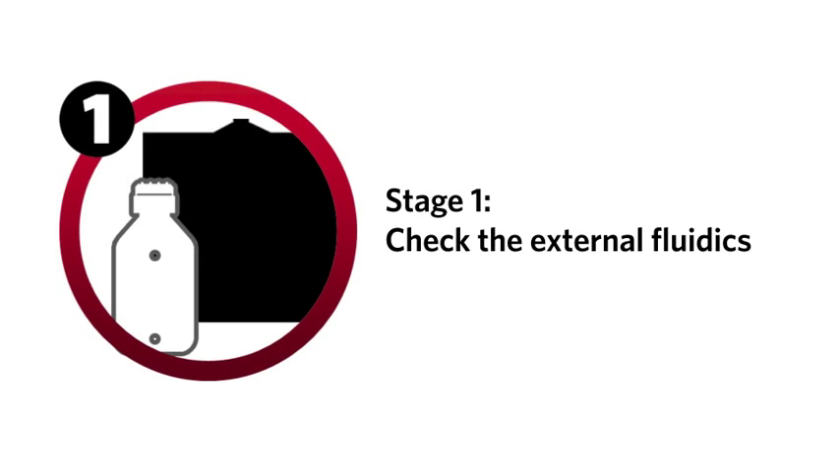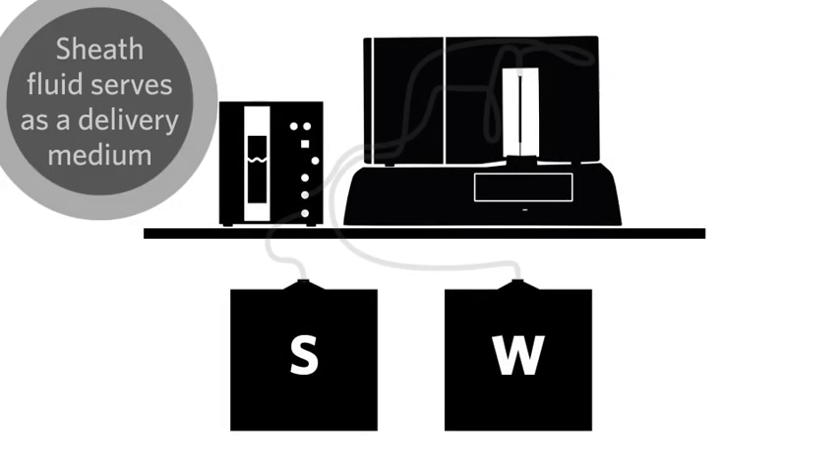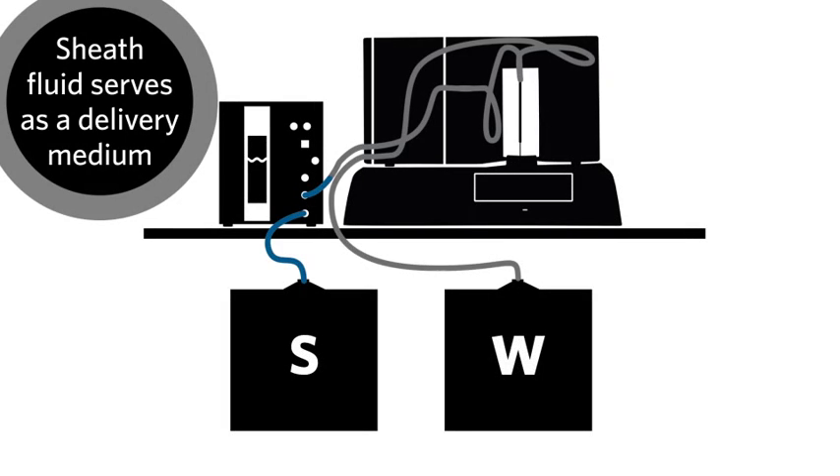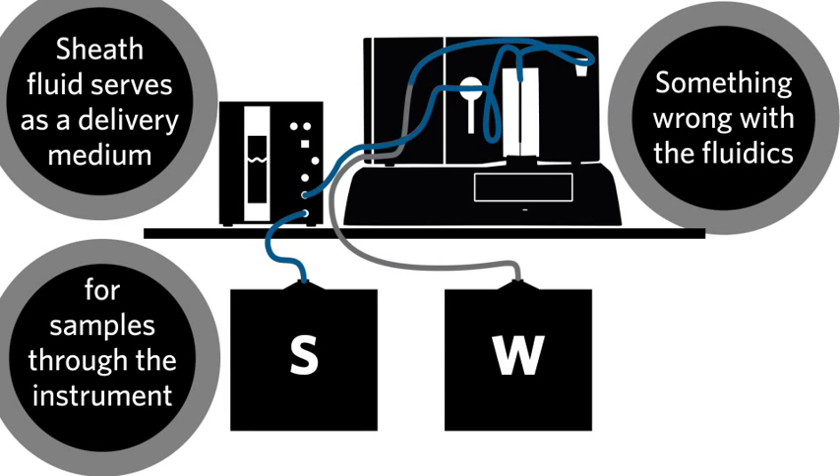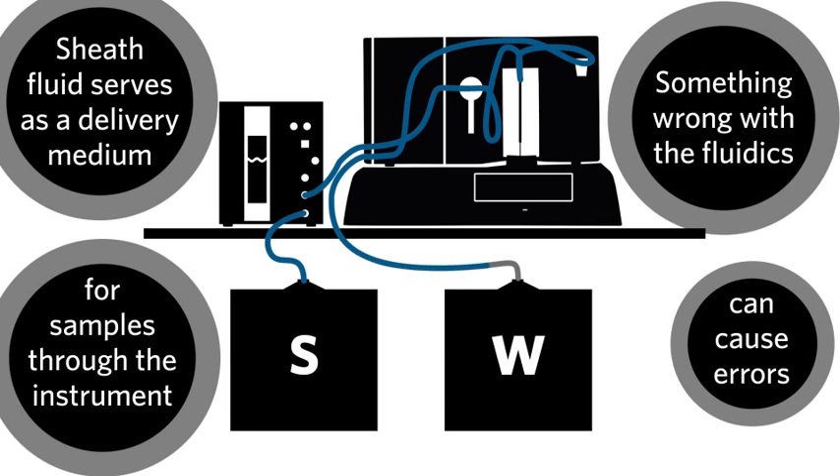Stage one: check the external fluidics. The first step is to check the external fluidics components including sheath and waste fluid containers, lines, and connections. Sheath fluid is important because it serves as the delivery medium to transport samples through the instrument. If there's something wrong with the fluidics on the Luminex 200 instrument, it can cause errors.